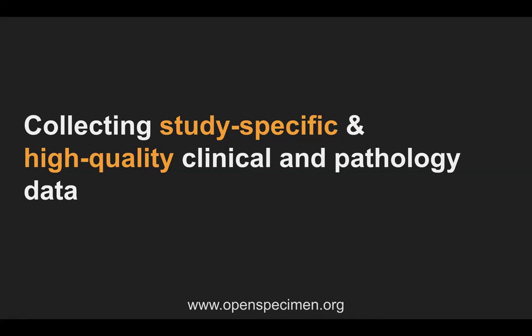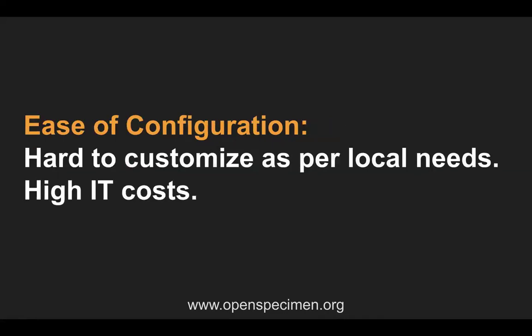For example, if you created a couple of new fields to collect clinical data, would they be available in your reporting module automatically to do the queries? Those are the kinds of challenges that our typical customers face. Now, having to do all this without much effort, that is, without either paying the vendor like us to do these configurations, or having to have internal resources with IT or programming skills, is important. So the biobank staff should be able to do most of these configurations themselves.